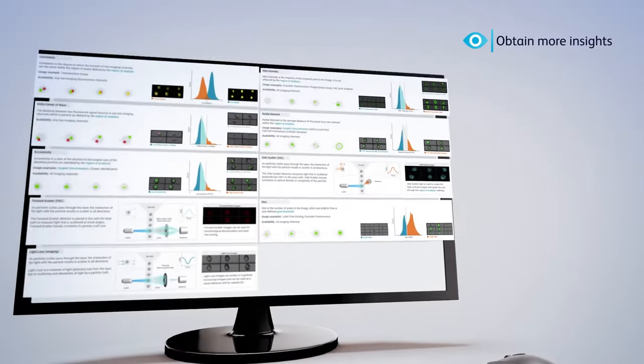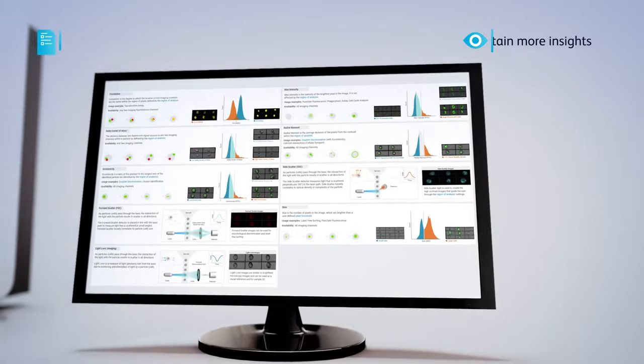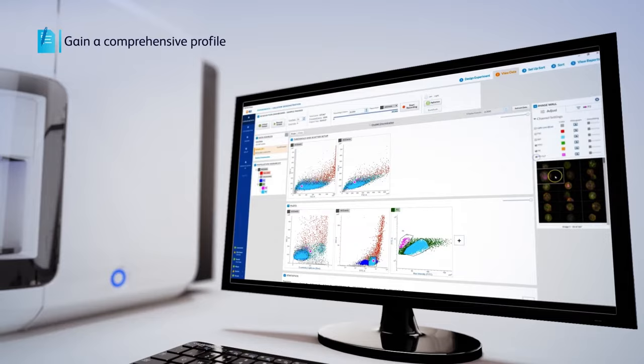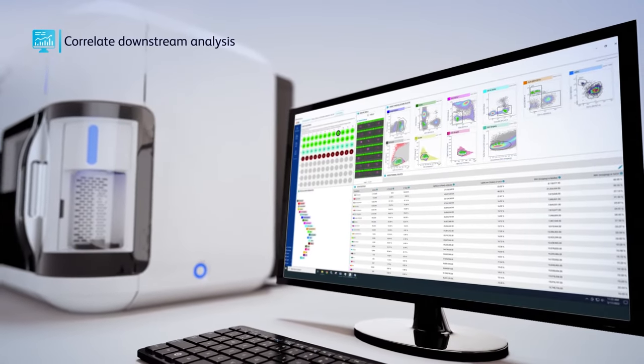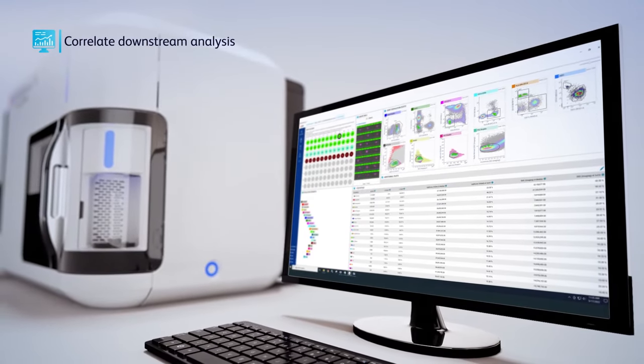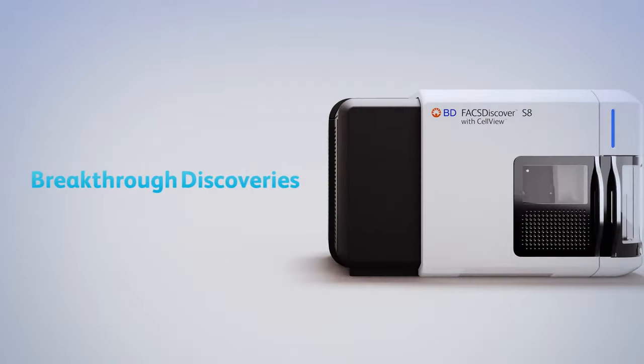Obtain additional insights on cell populations and characteristics with more comprehensive profiling, and correlate downstream analysis with imaging and traditional flow data, all to drive breakthrough discoveries.